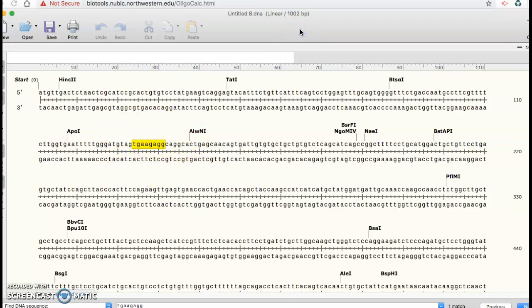So next thing I would do is I'd write down my forward and my reverse primers, both from 5' to 3', submit those to me, I'll check them out, and hopefully those primers look good and we'll actually order those from IDT, and we'll do some sequencing with those primers. But I thought this was just a cool opportunity for you guys to actually design something in lab. Instead of me giving something to you, this is exactly what you would do if you were doing some sort of research project and you had to design some primers. So give it a try. It's a cool skill to try.